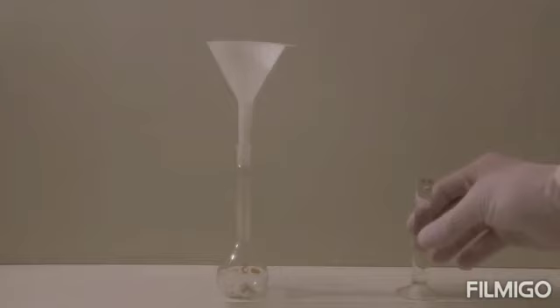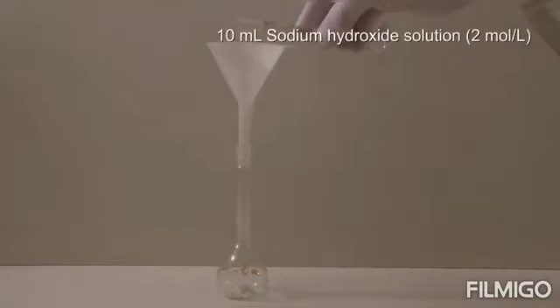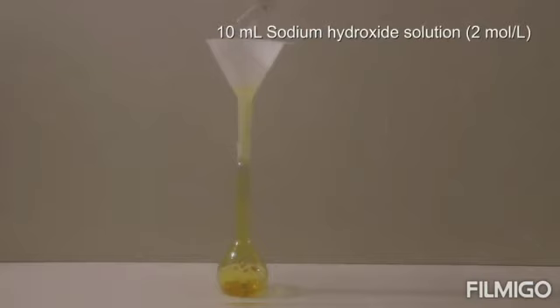After addition, we have to add near about 10 ml of sodium hydroxide solution, that is 2 molar concentration, into the flask. Here we can observe the yellow color after addition of sodium hydroxide. Then dissolve all the reagents properly, shake the flask.